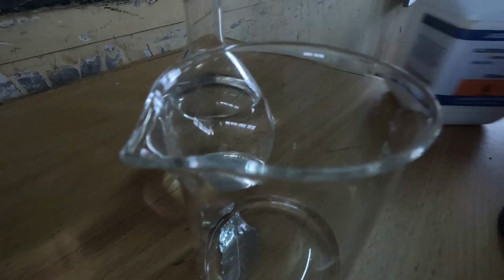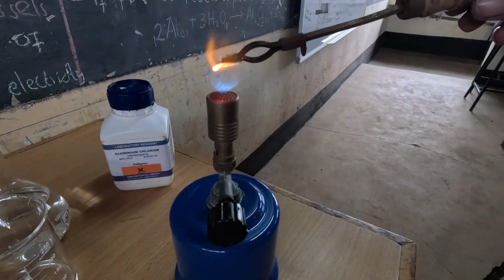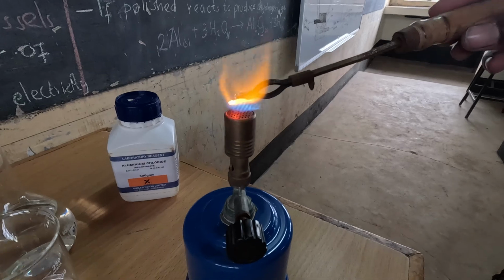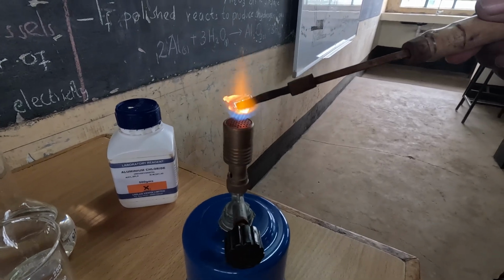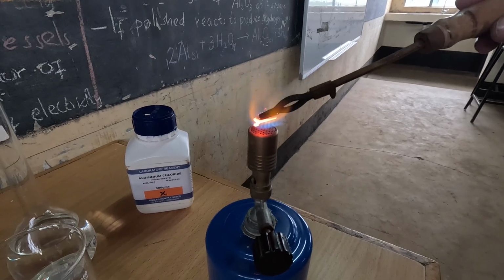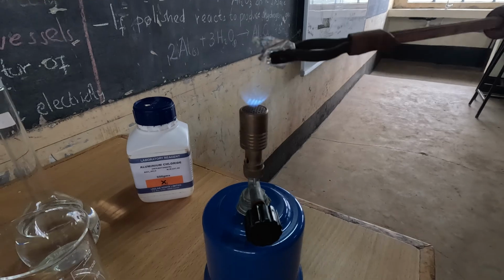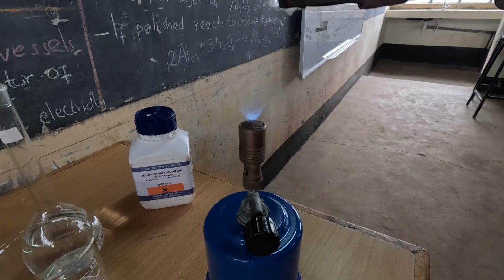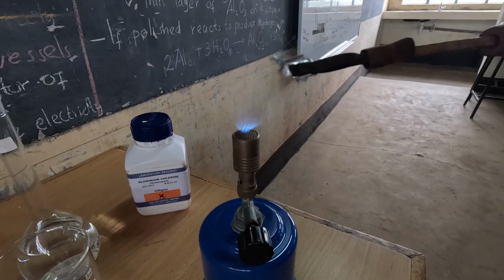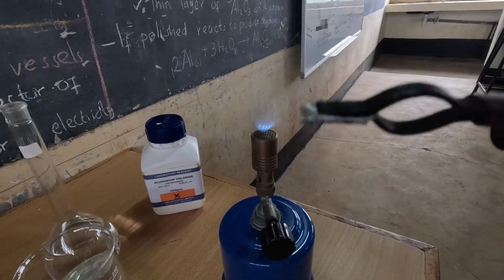So I'm going to burn my aluminium. What you will see, it seems to burn completely like paper, and you are seeing it is getting even red. But if I remove it, it returns back to be the same aluminium. The only thing that has changed is a white coating of aluminium oxide that has been formed there.